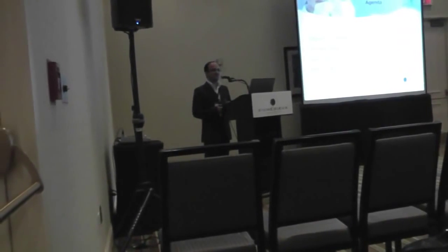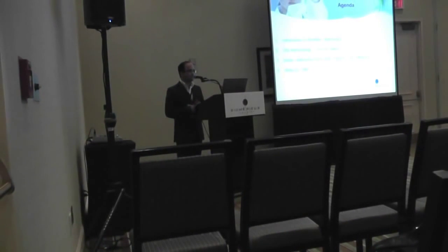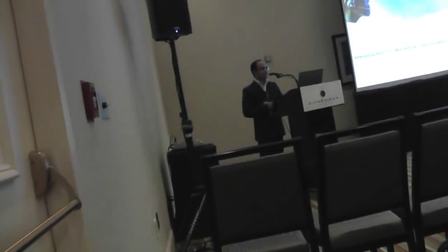The agenda for today, I have it really simple, short enough. What is workflow optimization? I'm going to talk about that, the methodology, which is Lean and Six Sigma that we use during all our project work, as well as the study that was done on optimizing the salmonella protocol, which resulted in a gain of efficiency and effectiveness in a lab environment. At the end, we'll wrap up with any questions and answers.